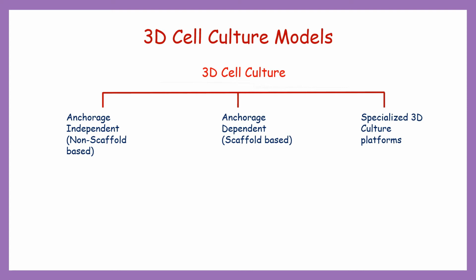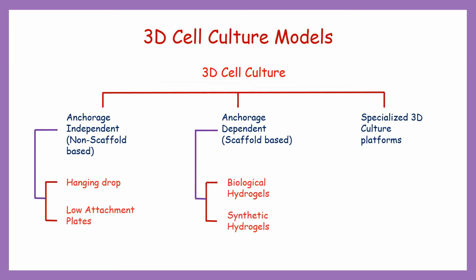Anchorage independent includes two techniques. First is hanging drop and another is low attachment plates. Anchorage dependent, which is scaffold based, includes hydrogel technique, which is divided into biological and synthetic hydrogels. Specialized 3D culture platforms include microfluidic devices and micro-patterned plates. So now let's learn these techniques in detail.